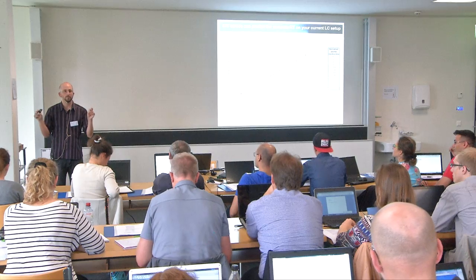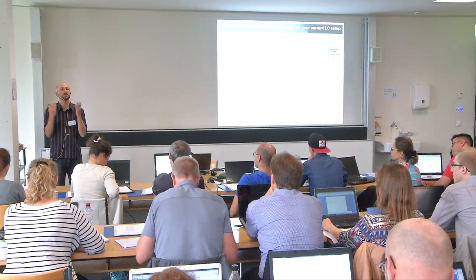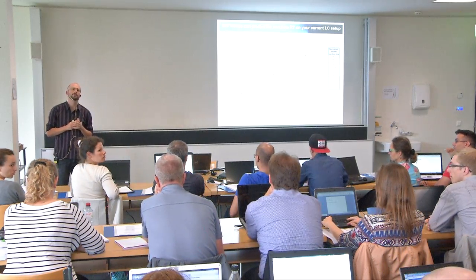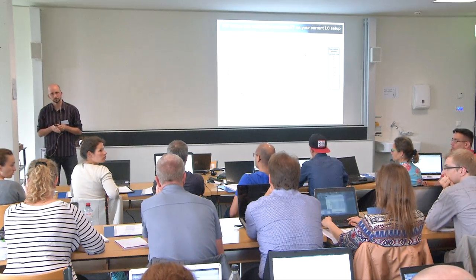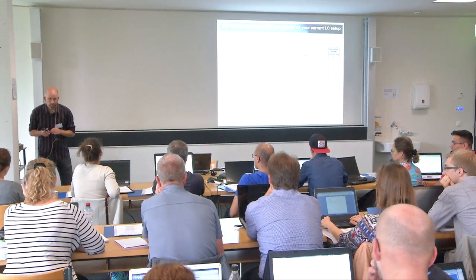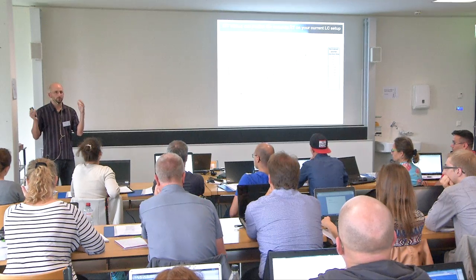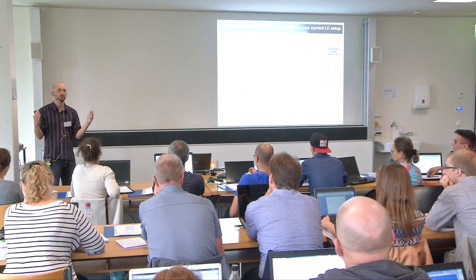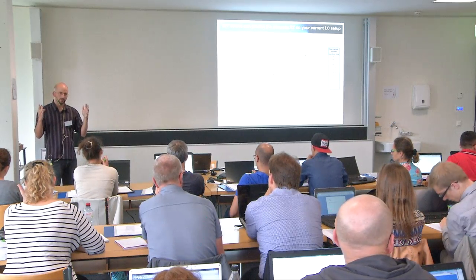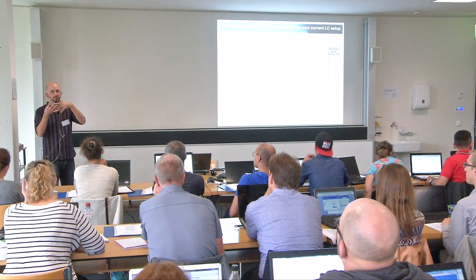But if both labs convert to iRT values, this is a value that you could compare. Both labs have to use the same kind of standard. So in theory, yes. In an ideal situation, both of them use the same iRT kit and then the values are transferable. Although you could envision a situation where that doesn't happen and then you need to convert one into the other.